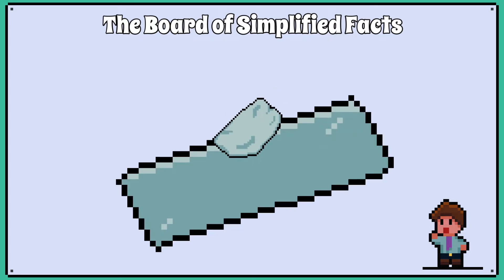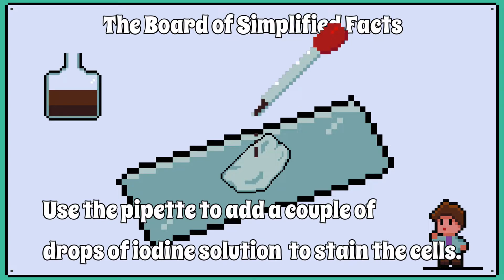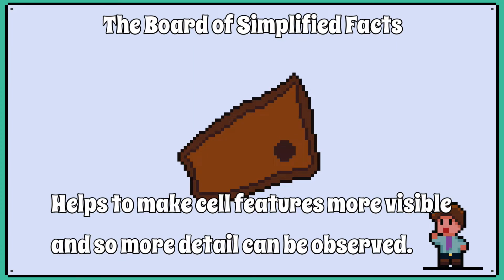You then place the epidermis onto a glass slide. Using a pipette, we add a couple of drops of iodine solution to stain the plant cells, which should make the cell features more visible and more details can be seen.